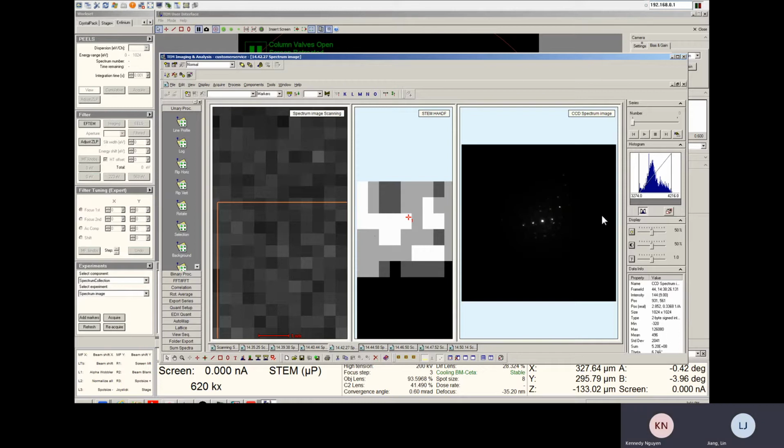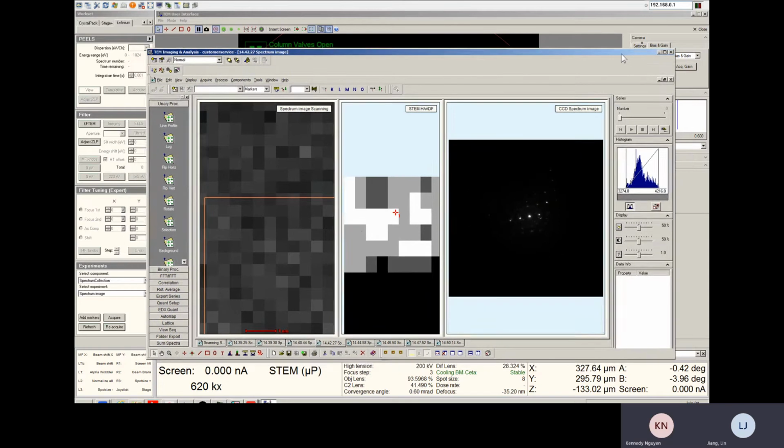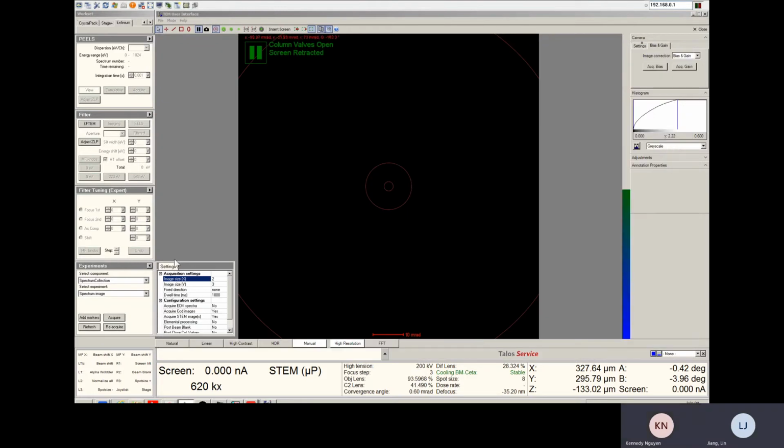I think it'll be easier just to do it twice. Just scan it twice. Do one with the detector. Oh, yeah. That way we don't have to do any complicated calculations. Yeah, that's another way. You can take it twice. If you take it twice, that's the easy way, right? Yeah. Okay. Cool. Yep, you can take it twice, but that's going to take a lot of space.